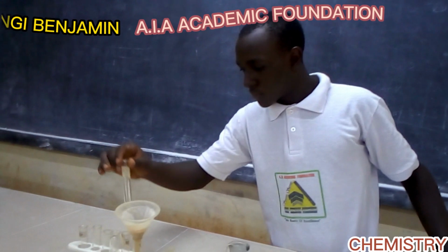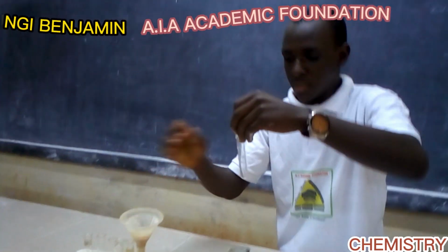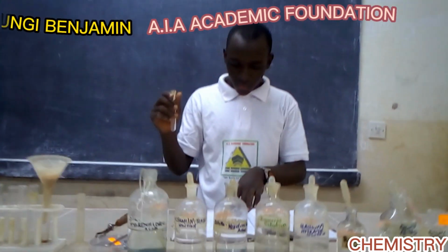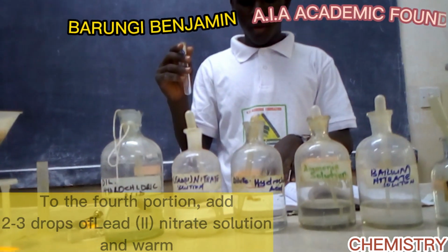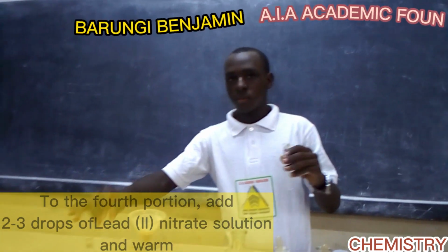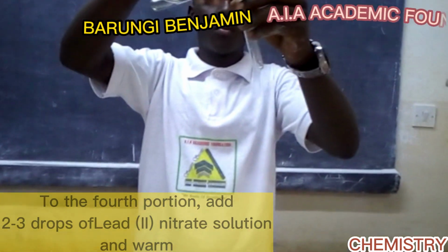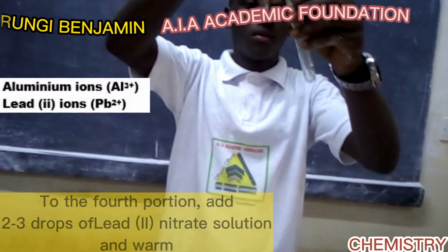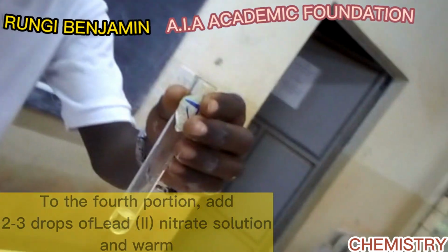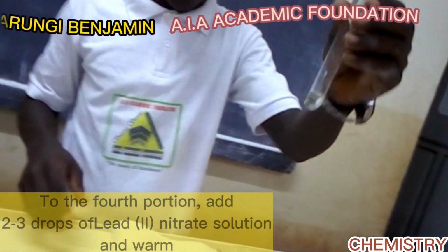Now, they have told us to add, to the fourth portion, 2 to 3 drops of lead 2 nitrate solution and warm.